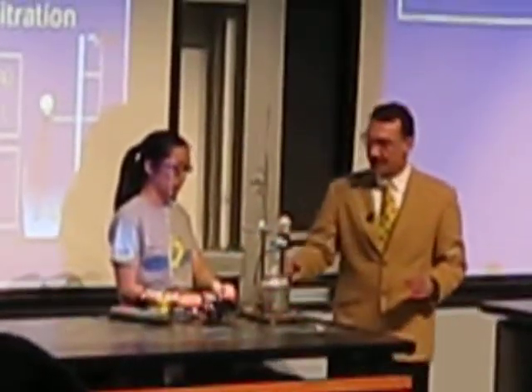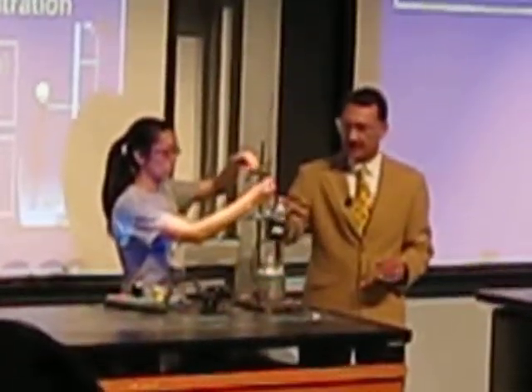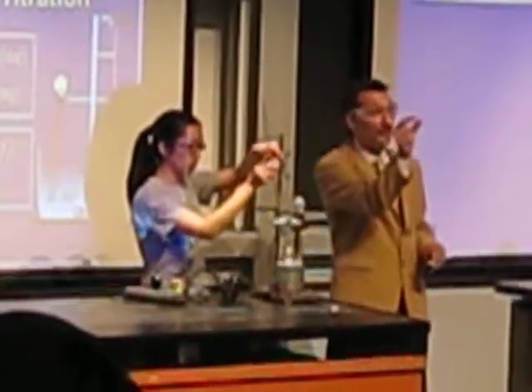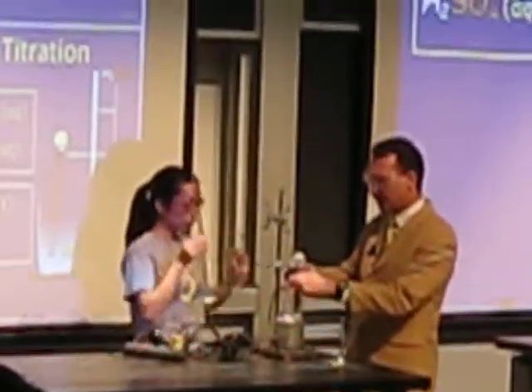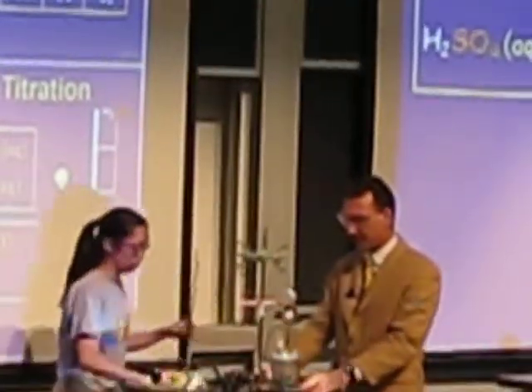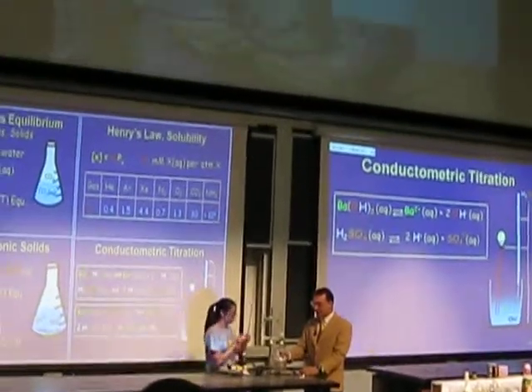Now notice, in pure water, this light bulb has 2 electrodes into the water, but the electrodes are separated. We have a shot of that? If I could rotate, I'm going to rotate it just a few degrees here. I can't do it easily. I'll rotate the whole thing. So you can see those 2 electrodes are separated, so no current can flow between them because there's no ions in pure water.